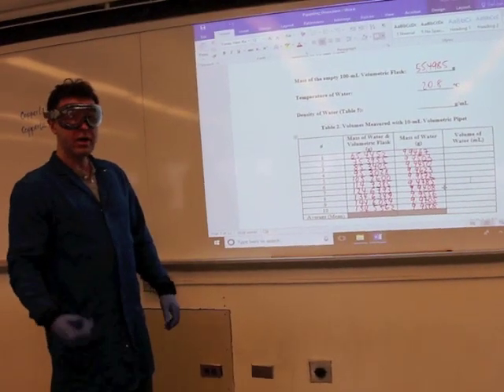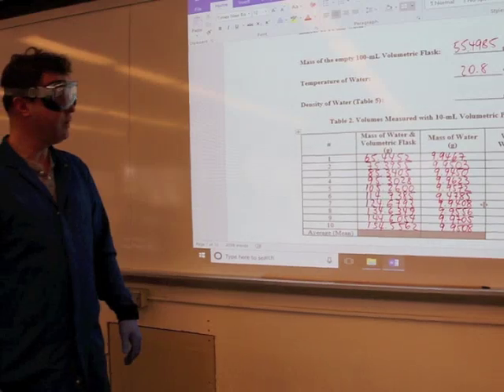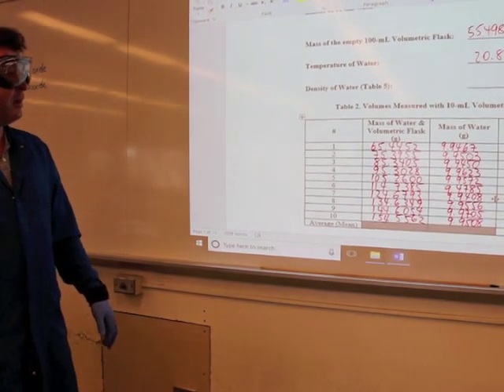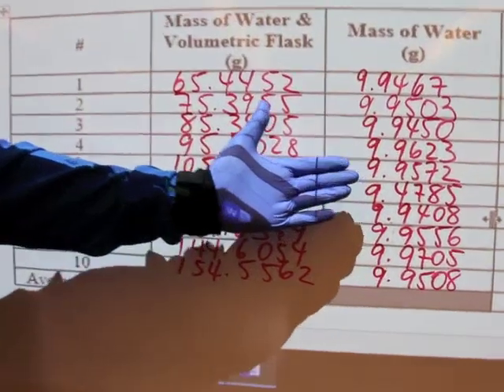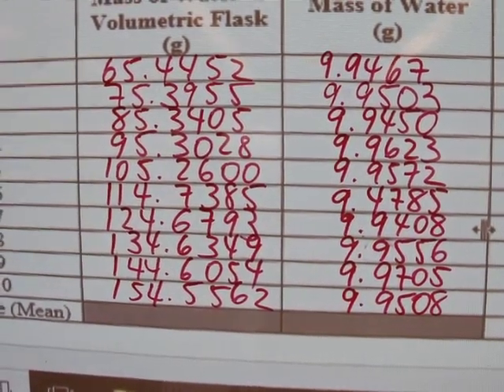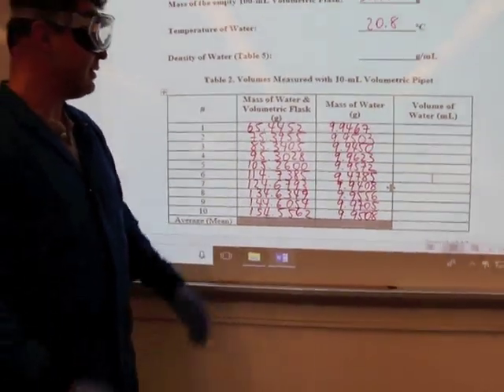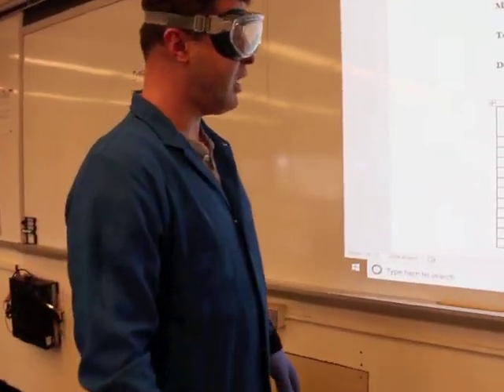We just performed nine more measurements using the same technique, and we now have 10 data points for which you will determine the average mean and standard deviation and relative error. As you can see, the data with the volumetric pipette - class A equipment with a precision of plus or minus 0.02 - tells you that you are very close to the 10.00 ml value. You can already state which of the two pieces of equipment - the 10 ml graduated cylinder or 10 ml volumetric pipette - is more accurate and precise just by looking at the data.